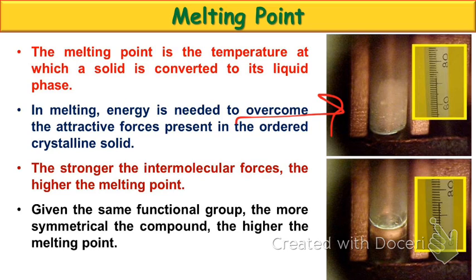When would the end of the melting point be? When it's all a liquid. Okay? And that's what that bottom figure is trying to show. So you'll be looking at these capillaries. These are extremely blown up. They're very, very small capillaries, much like your TLC spotters that you're going to be dealing with in lab next week.